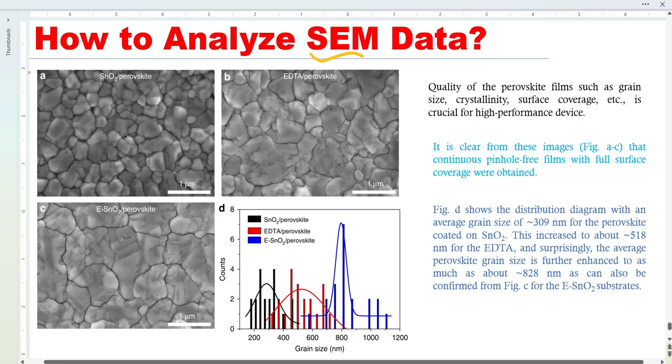We have three different samples. For example, we have perovskite material and we deposit this perovskite material on tin oxide. In the next sample, we basically change this tin oxide to EDTA - the same perovskite we deposit on EDTA.